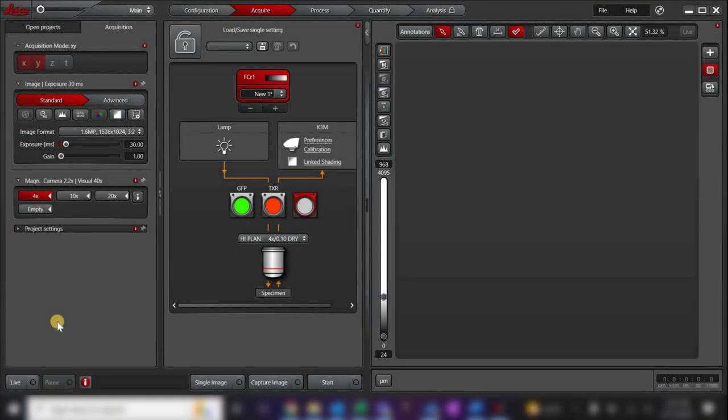In this video, we'll go over how to use the LASX software to take images with your DMI-L LED microscope. Here, I've already opened the LASX software. It is important to remember that the DMI-L LED is a manual microscope, so the software only controls the camera and cannot detect when you switch objectives or the filter cubes.